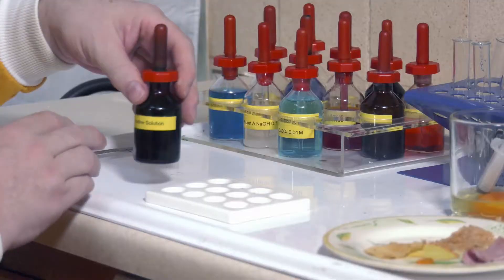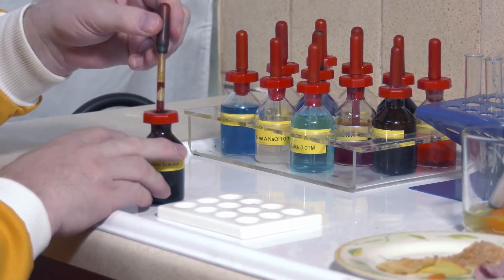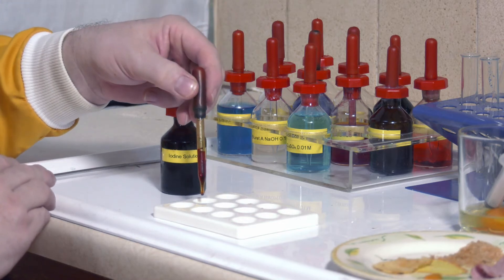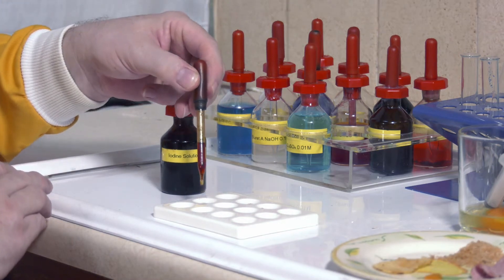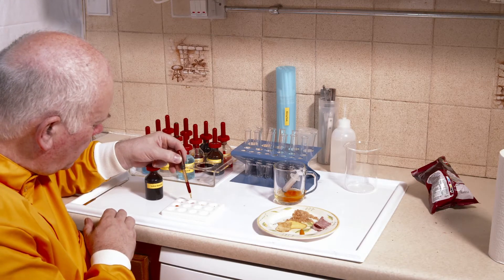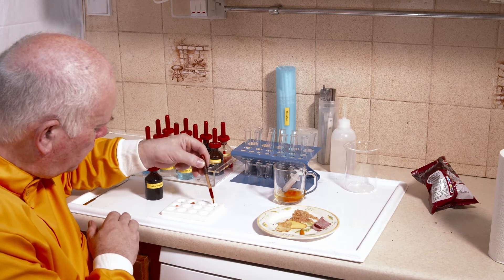I'll put my egg in like that. With the iodine solution, all we need is just a drop of iodine. I'm going to put a drop for the egg, for the bread, the meat, the cheese, and the crisp.